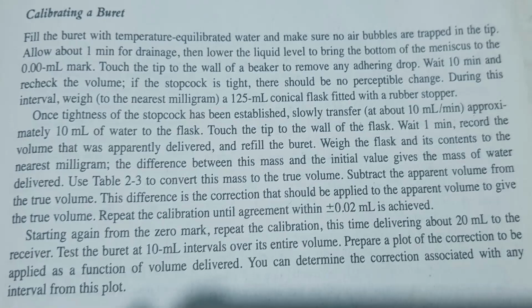If the stopcock is tight, totally closed, there should be no change in the meniscus of the liquid inside. Okay? When we fill the burette, it goes past the zero mark, so the first thing we do is make sure it is at zero. During this interval, weigh to the nearest milligram a 125 ml conical flask fitted with a rubber stopper. This is our receiver, just like with the pipette, where we weighed the receiver first.